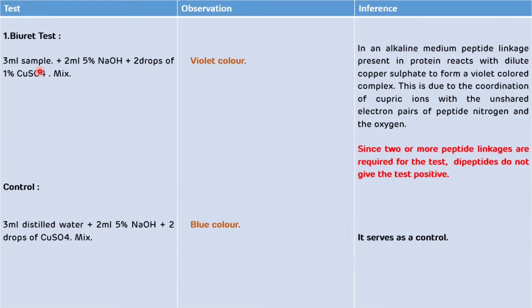Now we will see the procedure of the Biuret test. In a test tube, take 3 ml of sample and add 2 ml of 5% sodium hydroxide, then add 2 to 3 drops of 1% copper sulfate and mix it properly. If there is a development of violet color, that means the Biuret test is positive, indicating the presence of protein in the solution. This is because in an alkaline medium, the peptide linkage present in protein reacts with dilute copper sulfate to form a violet color complex.